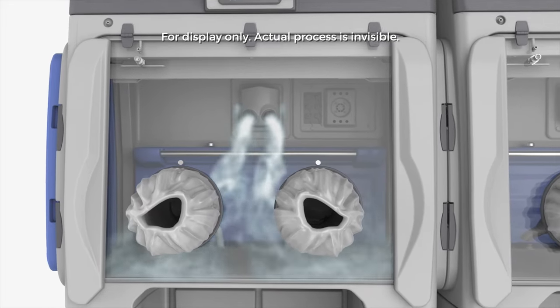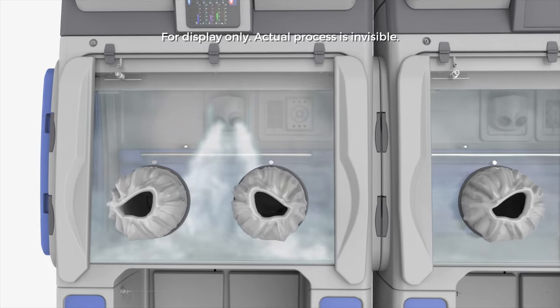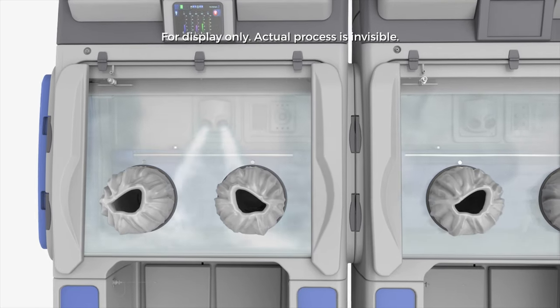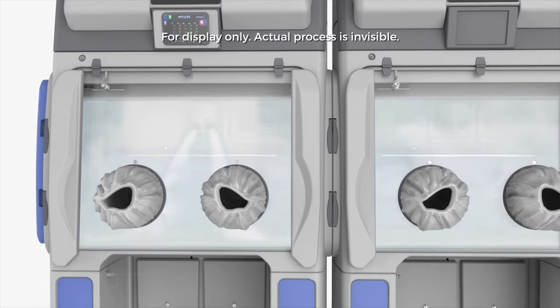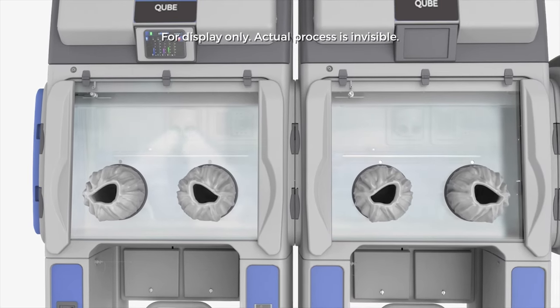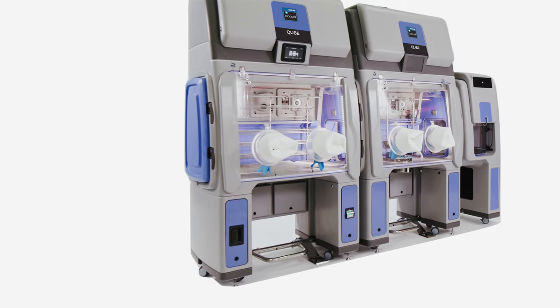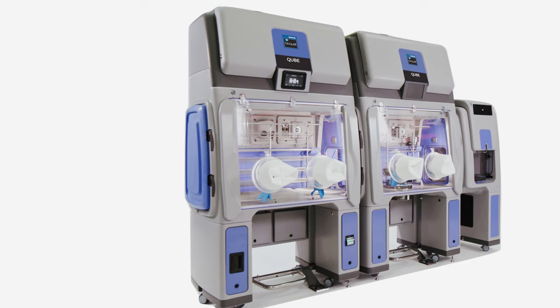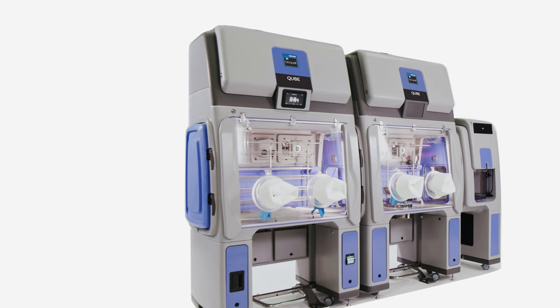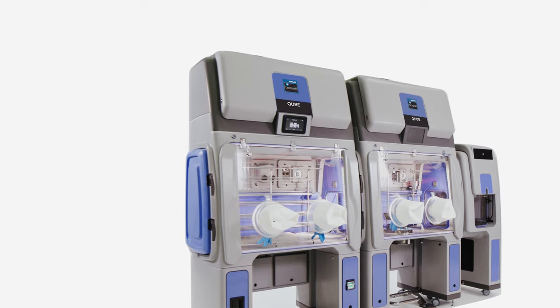Within the BioQuell Cube, an aseptic environment is created using BioQuell's integrated biodecontamination technology with BioQuell Hydrogen Peroxide Sterilent, and it can retain an aseptic hold in closed chambers for at least seven days. While it creates a Grade A ISO 5 equivalent workspace in the isolator, the system can reside in a lower grade cleanroom, saving gowning time and operating costs.